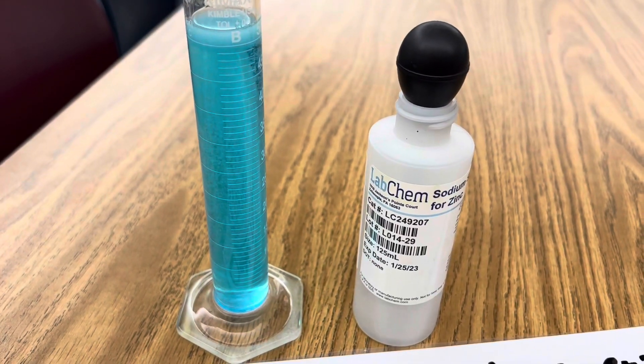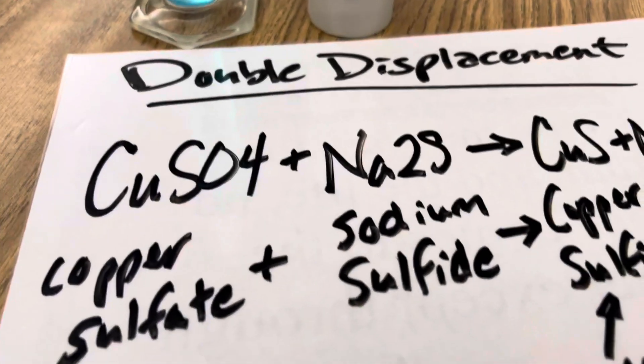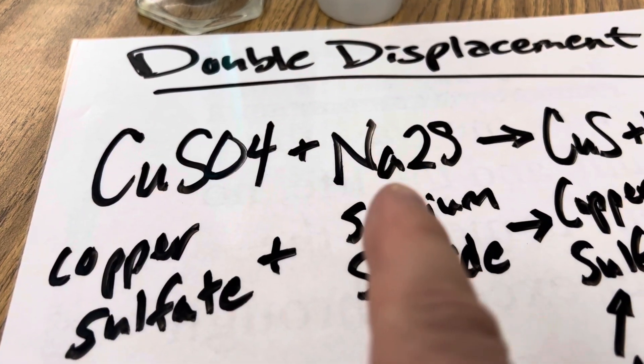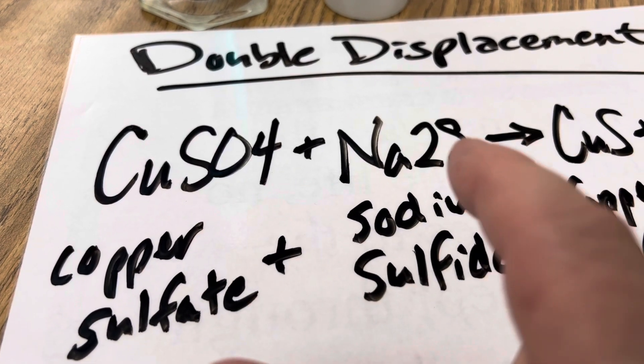Once all of your copper sulfate is dissolved in your graduated cylinder, add sodium sulfide and you'll observe the double displacement reaction where metals trade places with metals — your copper and your sodium — and non-metals with non-metals.